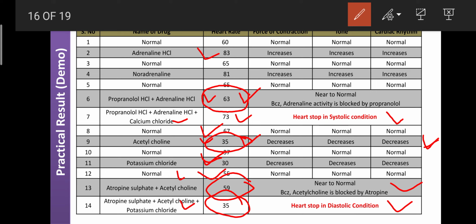So like that, cardiac stimulant and cardiac depressant activity was recorded with the help of the isolated frog heart, and also to study the antagonist property for sympathomimetic drugs and parasympathomimetic drugs, or to screen the activity of sympatholytic and parasympatholytic, or anti-adrenergic and anticholinergic drugs.